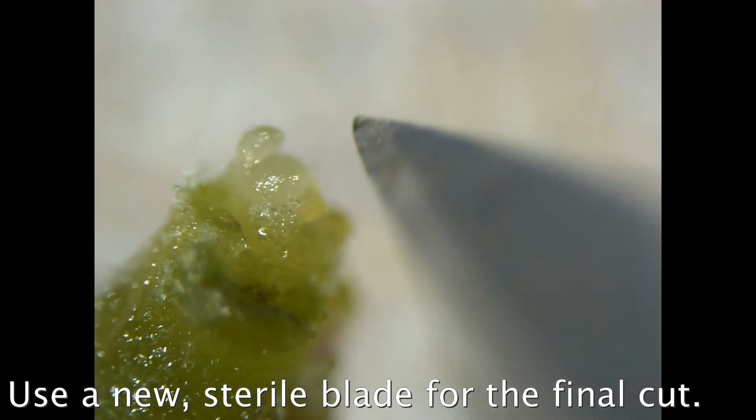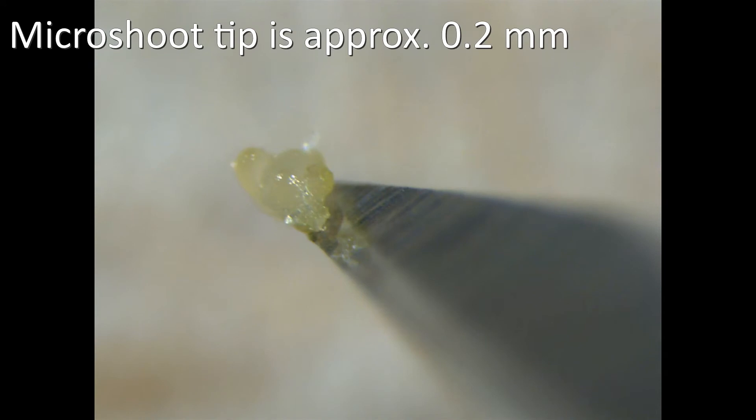Here's the tip — it's about 0.2 to 0.3 millimeters. It dries very quickly in the air, so you place it on top of the medium quickly and not too deep or it'll drown.